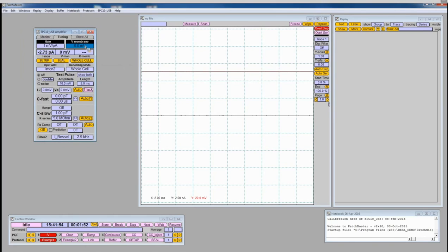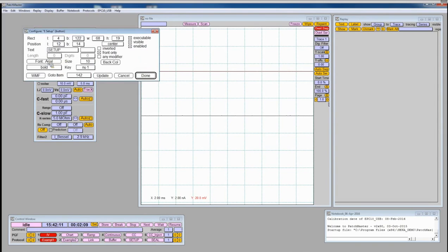Other things that you can change, for example, are the writing in those boxes. For example, let's change the writing in those auto buttons. Again, you go into the button that you would like to change the text of, Control left click, and that opens up the configuration for that button. Now, for example, this is the setup button that usually when you press it does automatic compensation of the offsets.